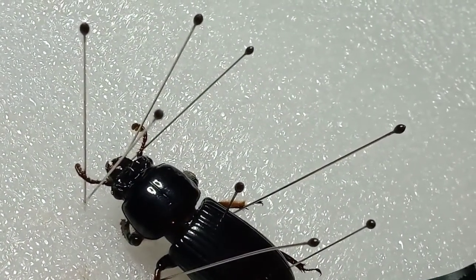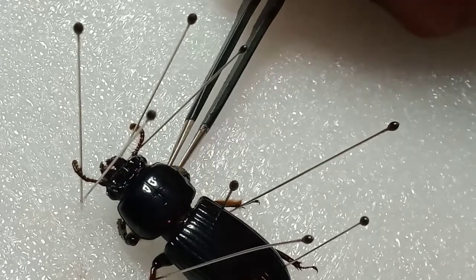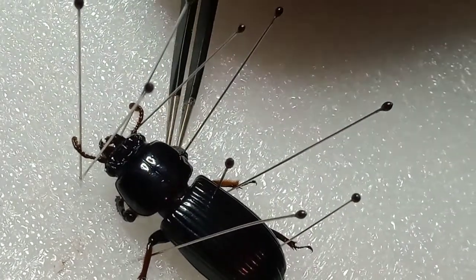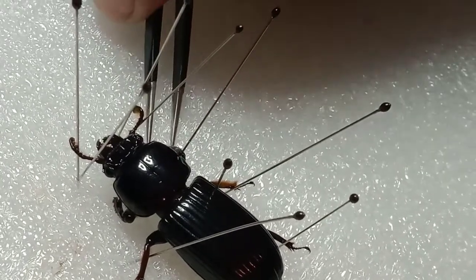Do the other side. I think this is called a ground beetle because they usually live underground. I found this one — actually, my friends found it in their backyard and sent it to me.